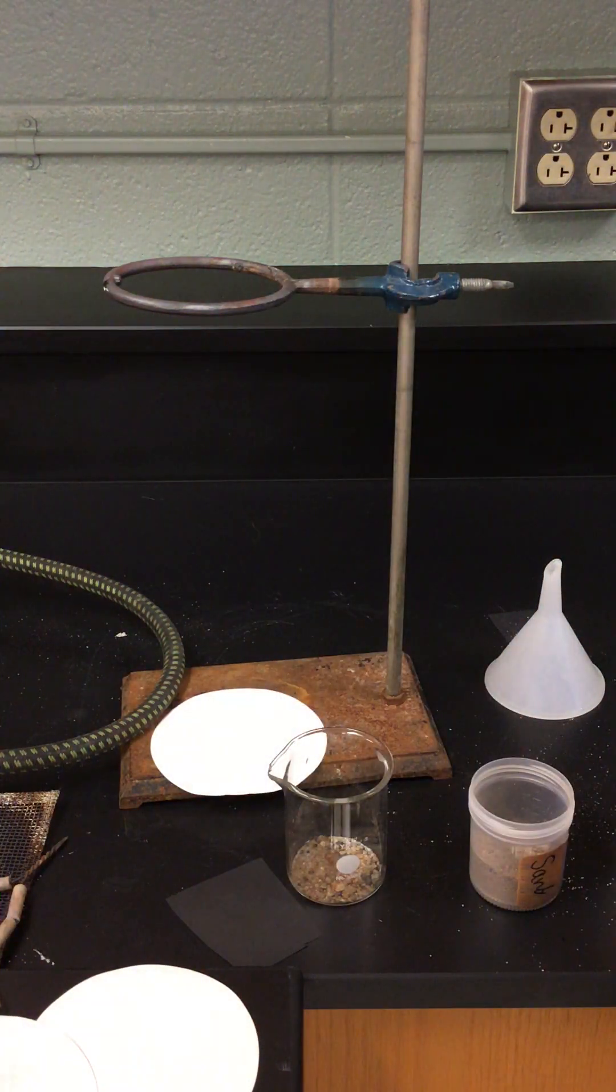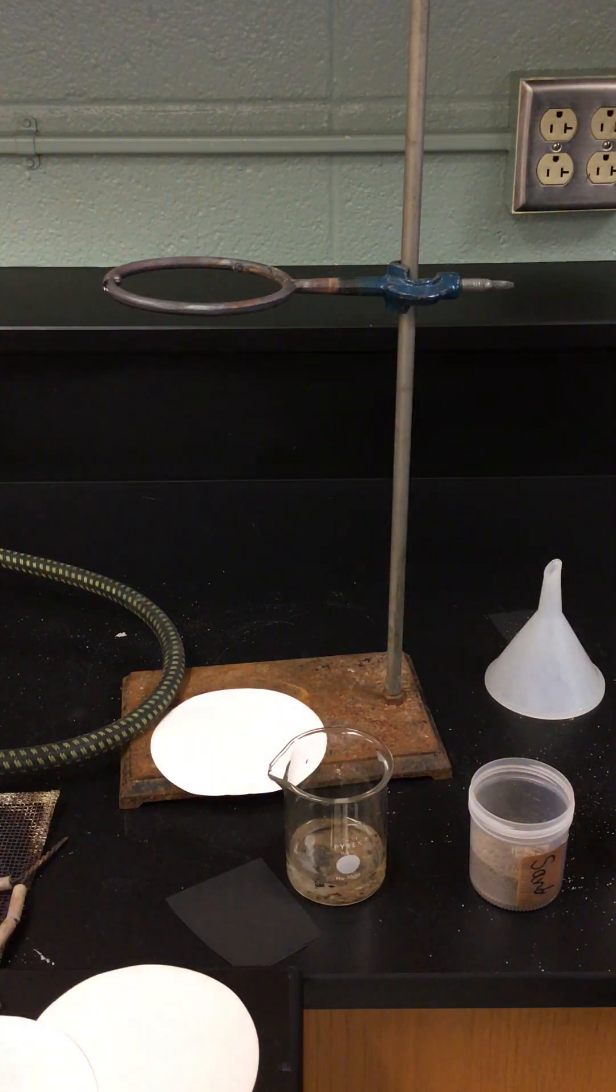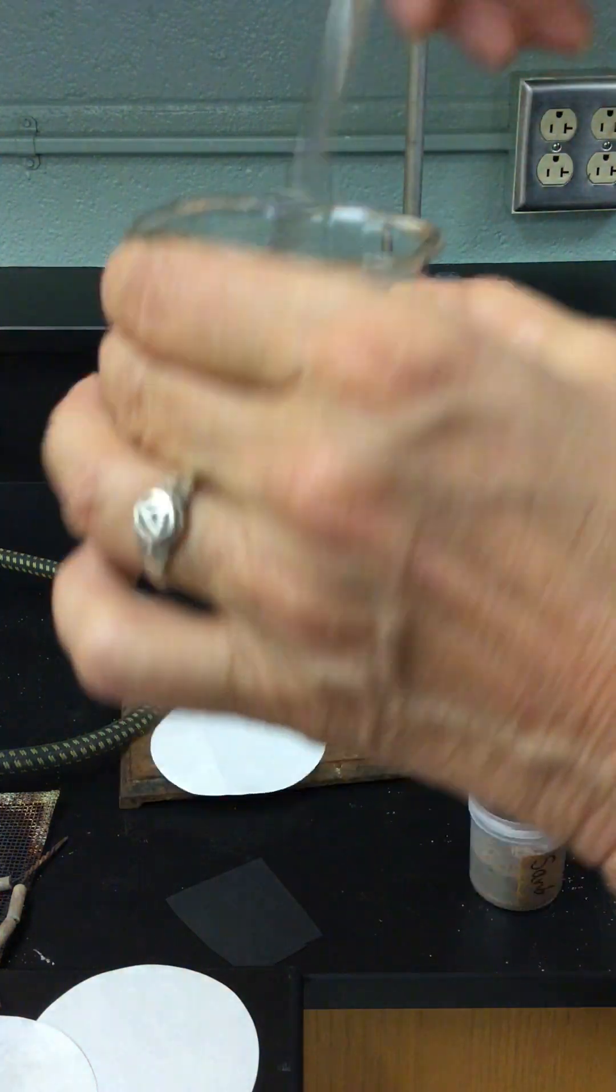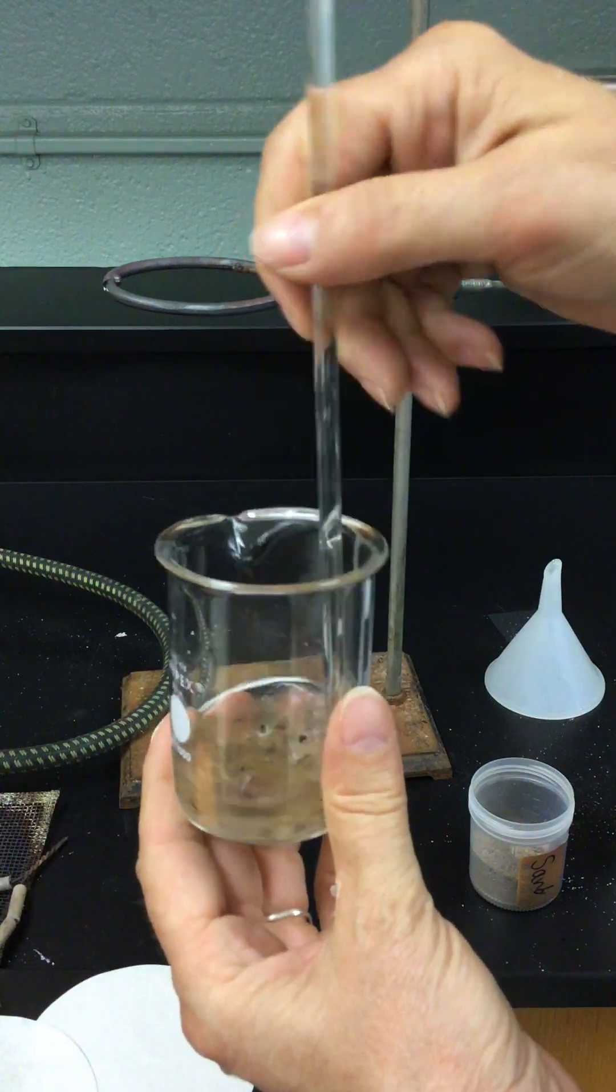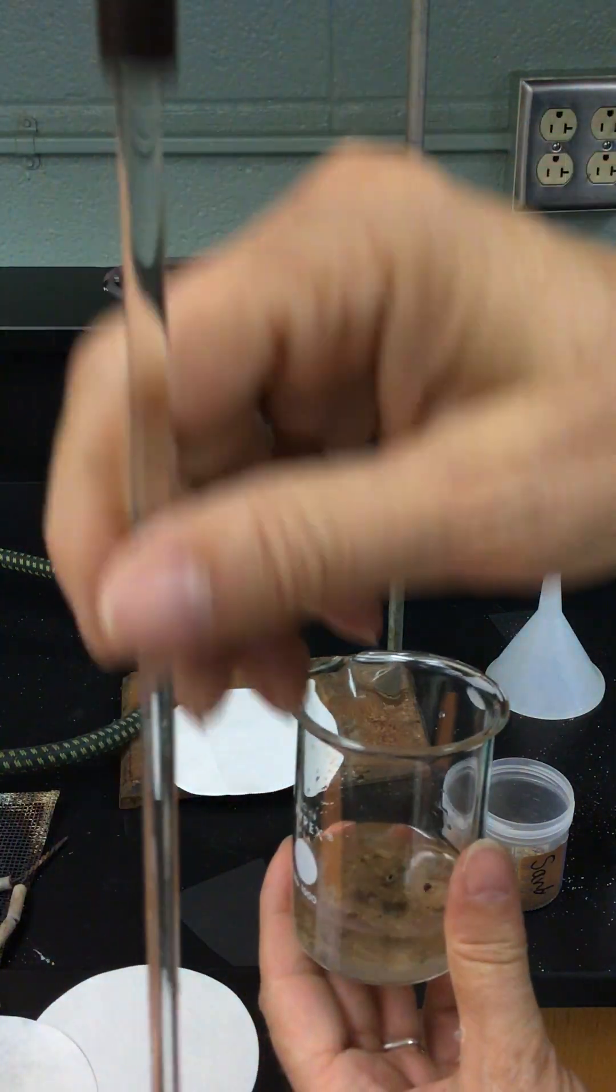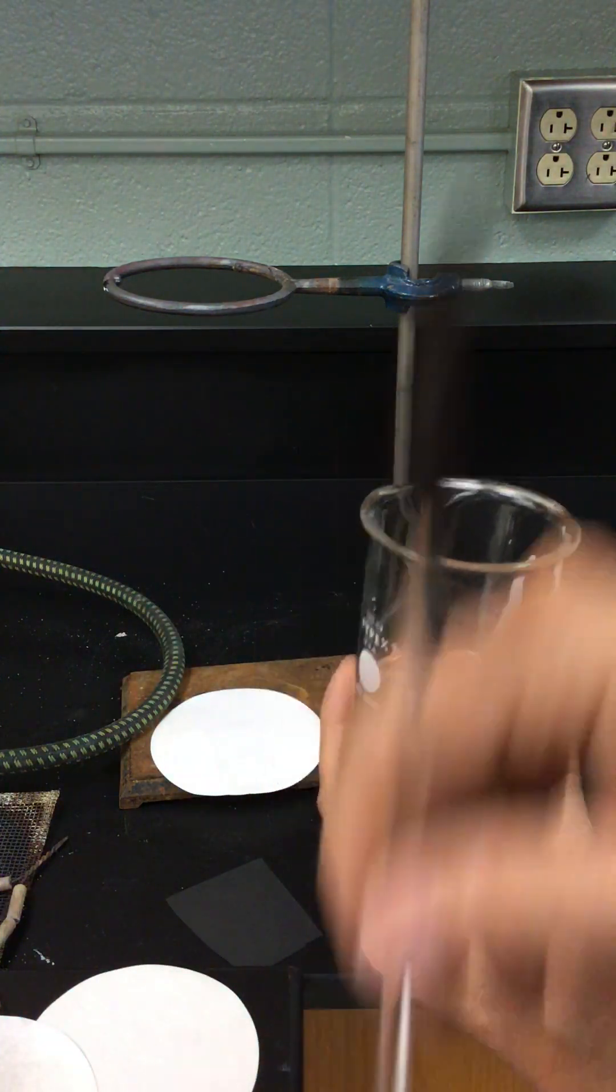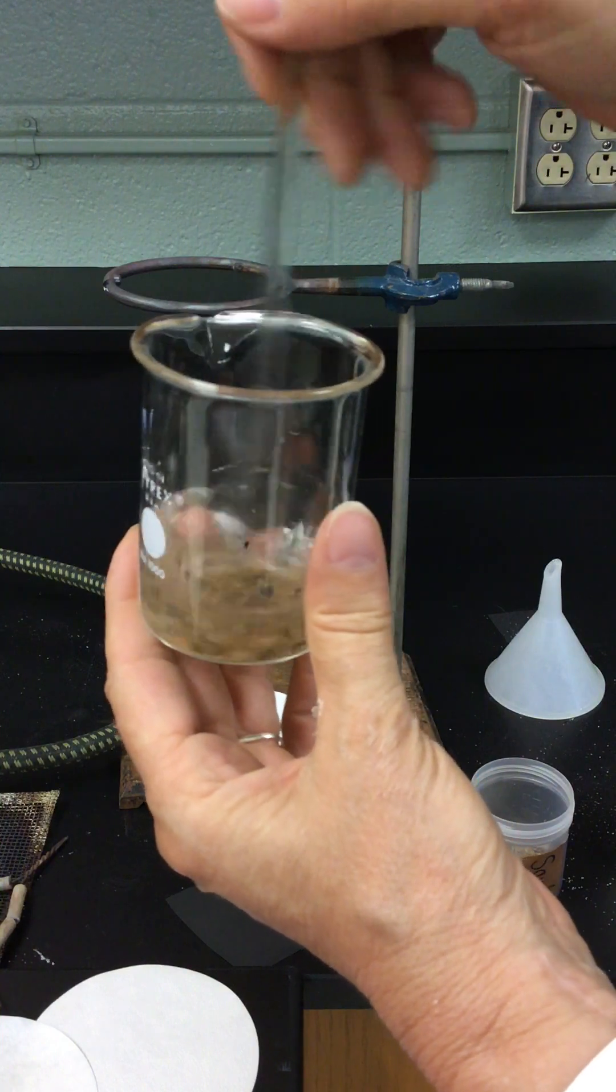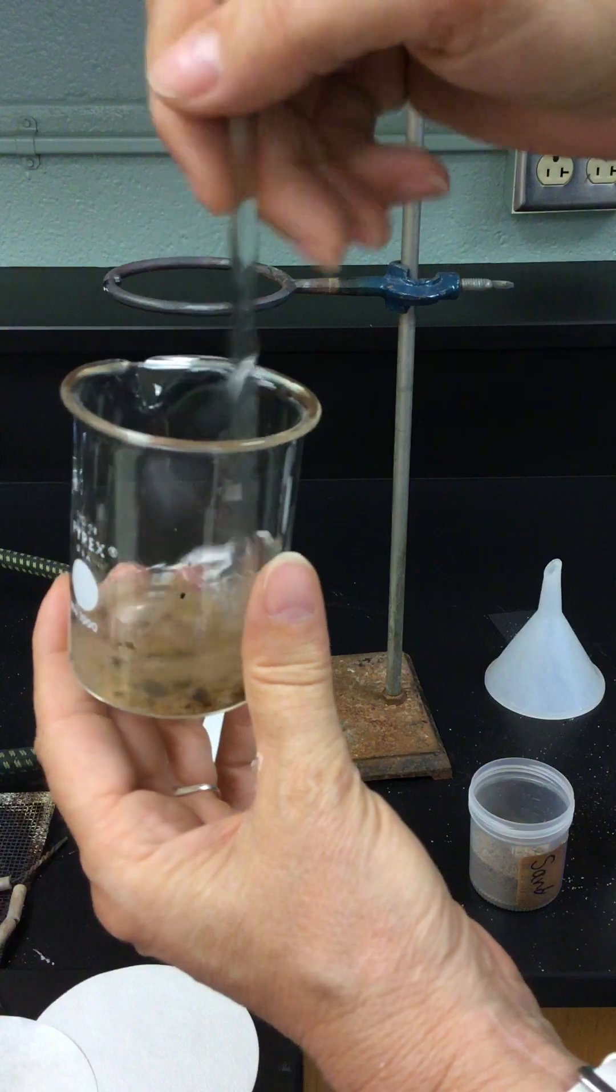Then we're going to place this in a beaker with some water. I'm going to cheat and pull the cap off this water and just pour some in. That's plenty. Then I'm going to stir this with this stir rod and a rubber policeman on top.